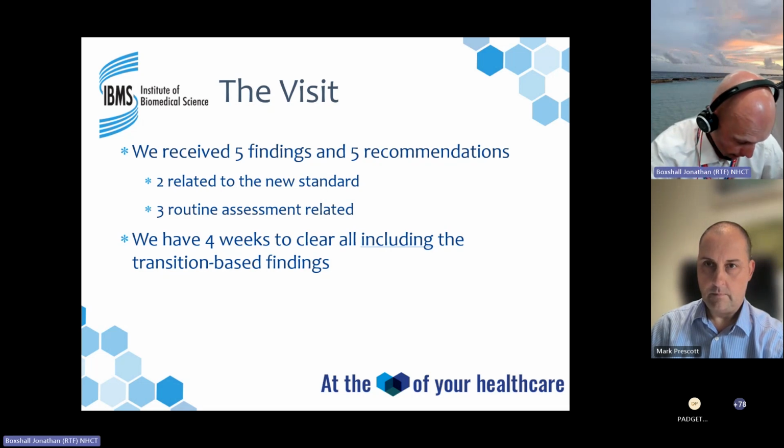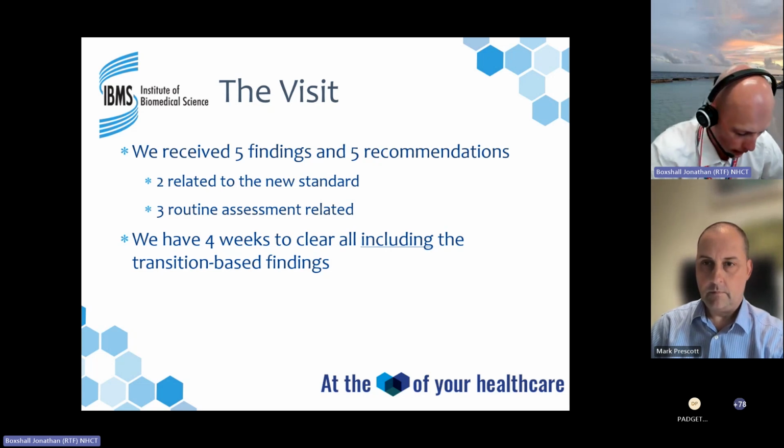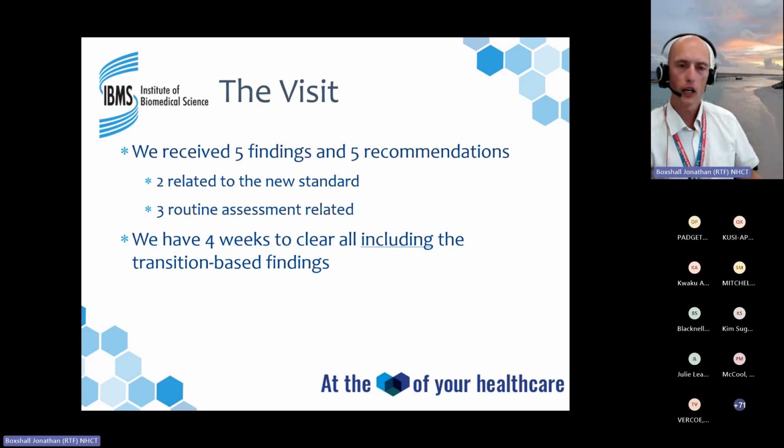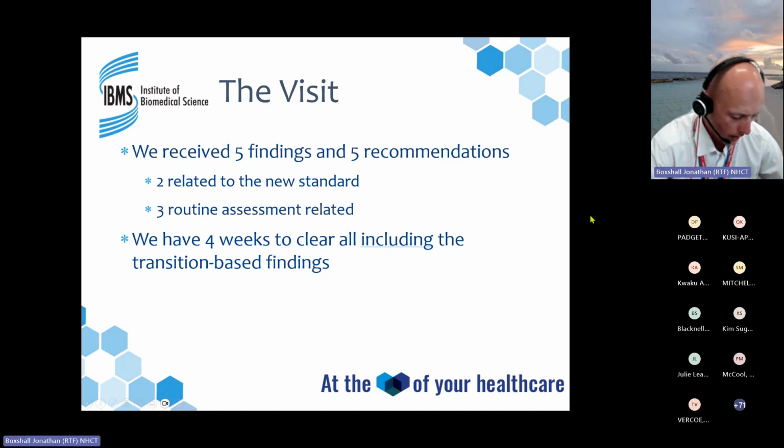And funnily enough, ERG was one of ours, about being able to demonstrate compliance. We've had a couple of instances anyway, but I guess it was more about testing people to make sure they knew what they were doing. Obviously, we've got 4 weeks to clear all findings, including the transition-based findings, so we don't get any more time. So just in case anyone thought it was going to be 12 weeks of transition, it's not. It's just standard 4.